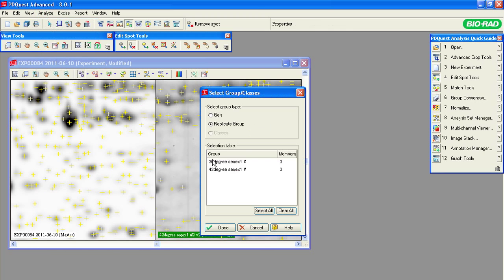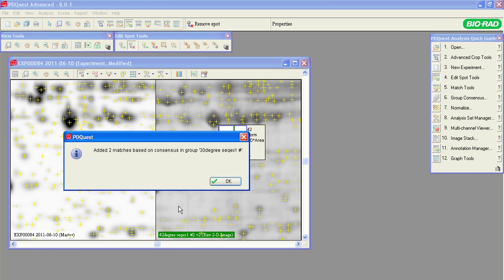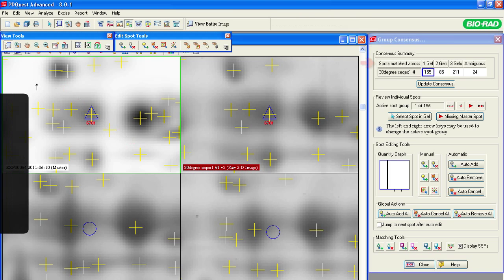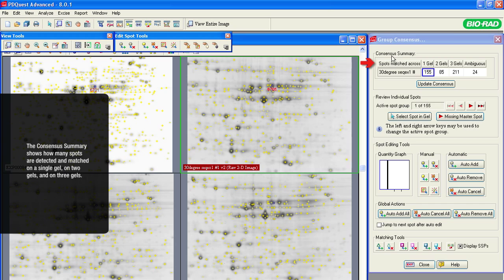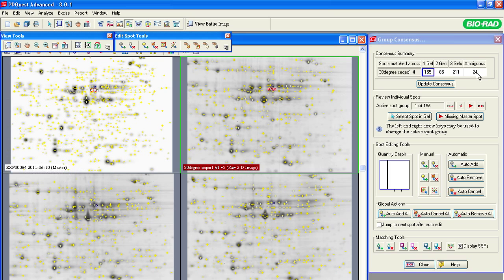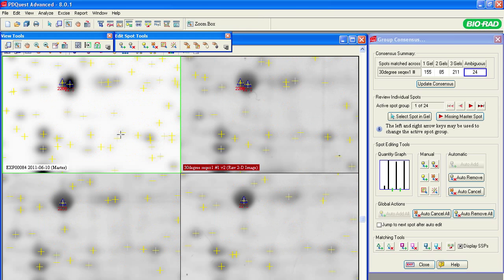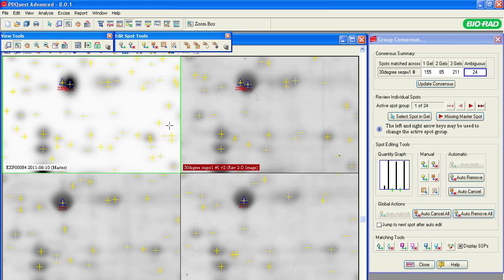Select this tool from the Quick Guide or from the Analyze menu. Select the 30-degree replicate group and click Done. To view the entire gel image, click on the first icon on the View tools bar. The consensus summary indicates how many spots are detected and matched on a single gel, on two gels, or on three gels in the group. Ambiguous spots are those that are mismatched due to a close proximity to each other on one or more gels.